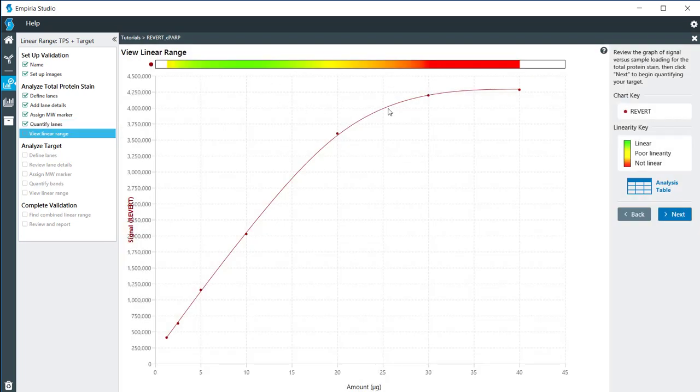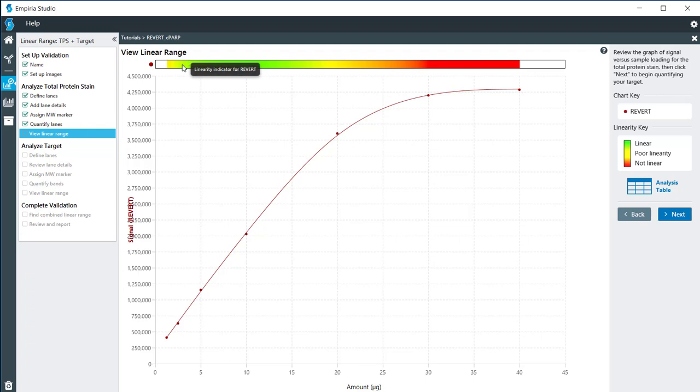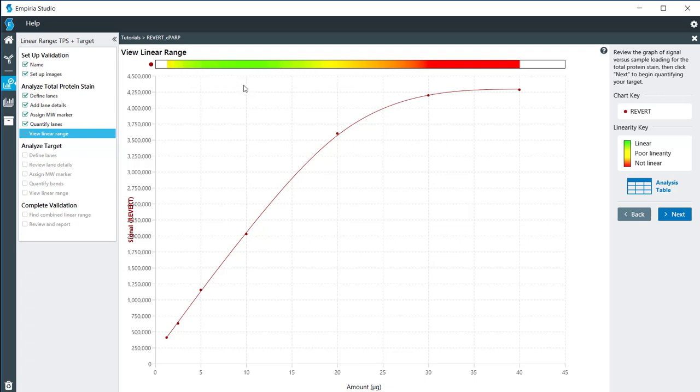Now we have a graph that plots the signal from the revert versus the amount of protein loaded. Up here at the top we have a graph or a color scale of what is the best range for linearity. What we're looking for here are these areas of green. Once we analyze the next image we'll be able to look at those combined.